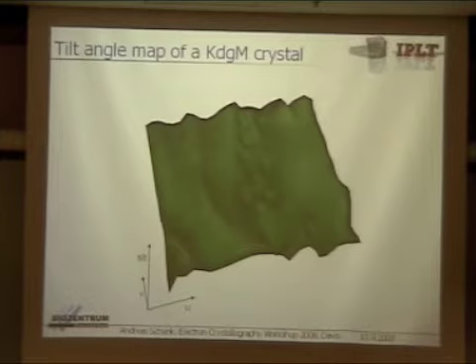So that's also the future direction we want to go. Basically, now with the simulation I have, you can also simulate these kinds of crystals, because you can have a shift and you can have rotation in every direction. So you could start and simulate these crystals and see how the diffraction pattern, the Fourier transform, looks, and what kind of distortion maps you get out of that. Then perhaps also better understand the experimental distortion maps we have, to see if this is perhaps more tilt than distortion in the unit cell.